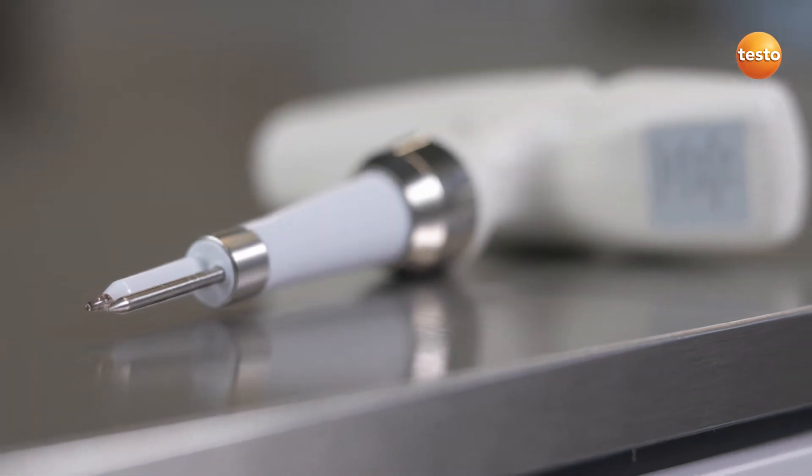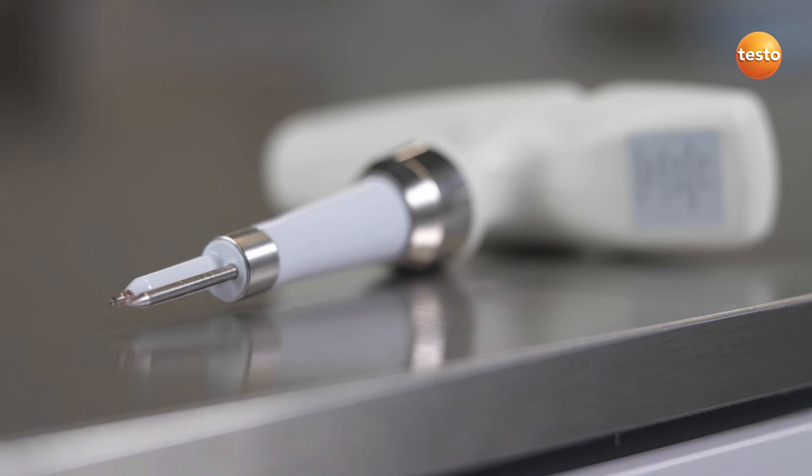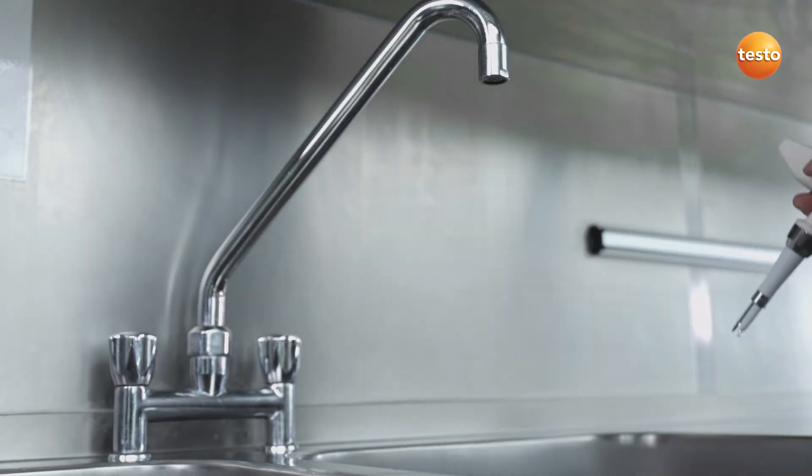The gel electrolyte ensures that the integrated pH probe is maintenance-free, leak-proof and insensitive to dirt. After the measurement, the combi probe can be cleaned without any problems under running water.